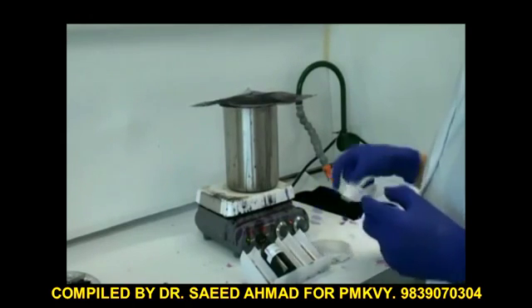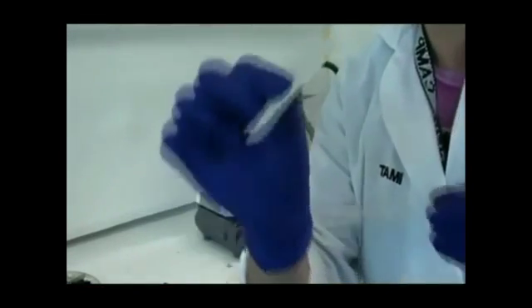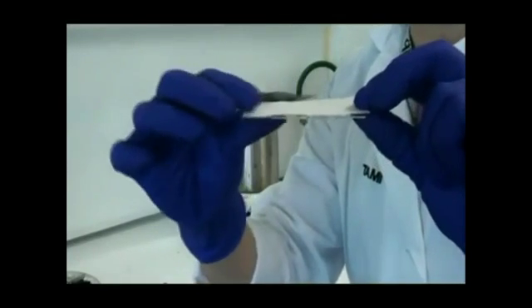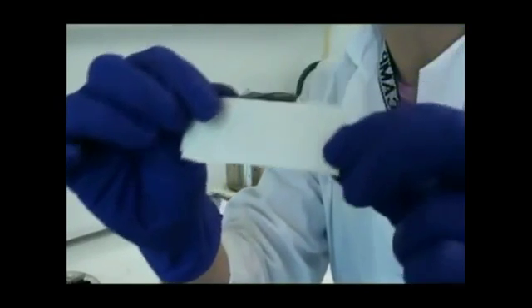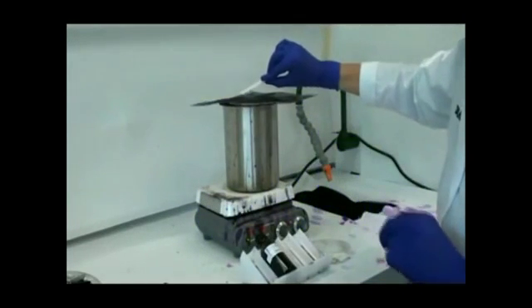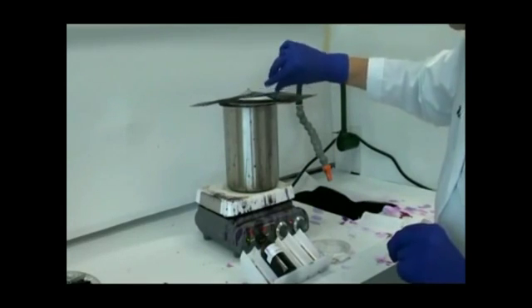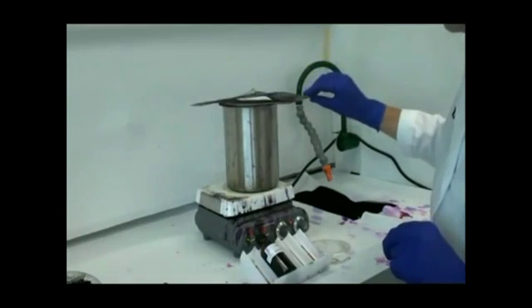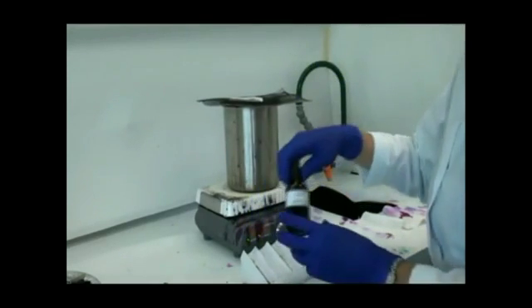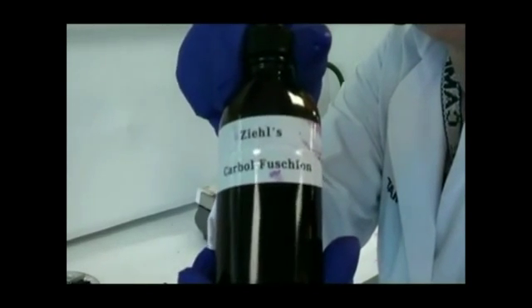For this step, I will need to put a piece of blotting paper that's been cut in the shape of a slide on top of that slide, right on top of the bacterial smear. I then place that slide with the blotting paper on top of my water bath. And now I'm ready to apply my primary stain, carbofuchsin.